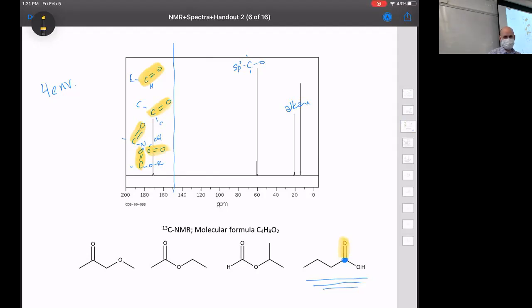So looking at the data that Chloe just told us about, you do have a carbon in a carbonyl, and you also have a carbon attached to an oxygen. But because those are two different peaks, those must be two different carbons. So your answer will have a carbon in a carbonyl, no matter what else it has attached, but it'll also have a different carbon that's attached to an O, just by a single bond.